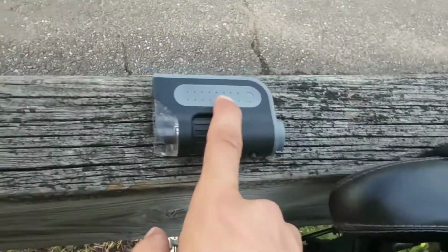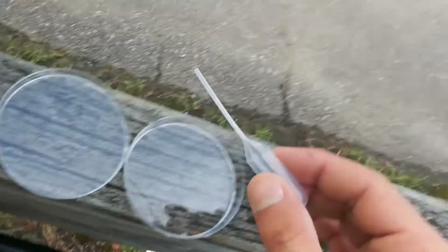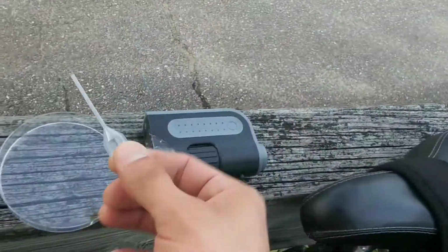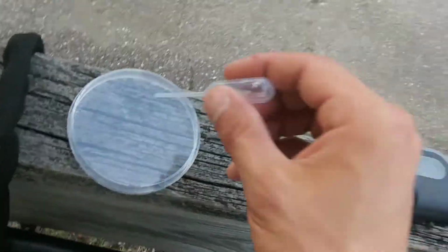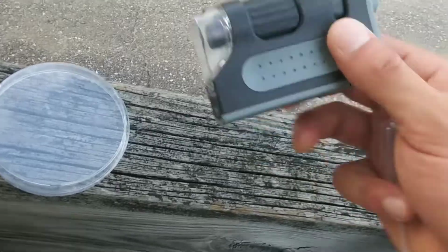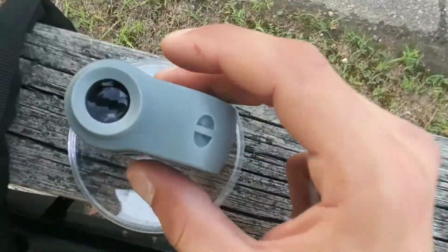So this one's the microscope, and then this is just a petri dish, and I've got a little water sucker-upper thing inside, and I'm just going to put probably like a droplet on top. And then this thing has a light, and we'll see if you can see what I see. Here we go.